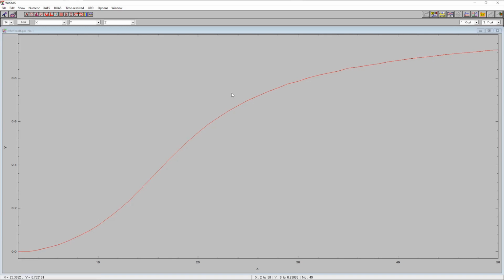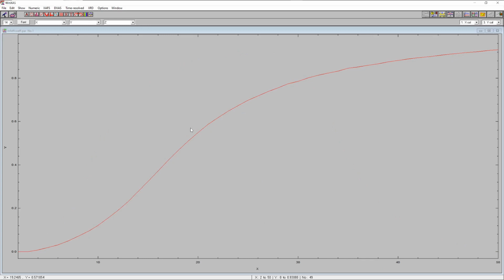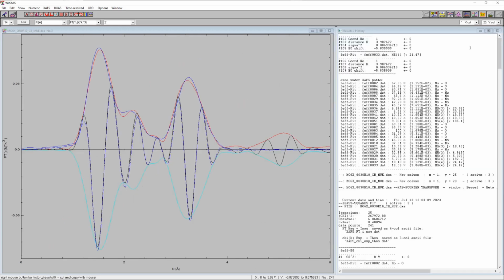The most important requirement for this to work is that you use the same order in the XANES fit and the EXAFS fit. So here we start with molybdenum dioxide and molybdenum trioxide, so dioxide, trioxide, and the same order you need to keep when you do the multiple phases EXAFS analysis. So this is why we also here start with the dioxide and then the trioxide.